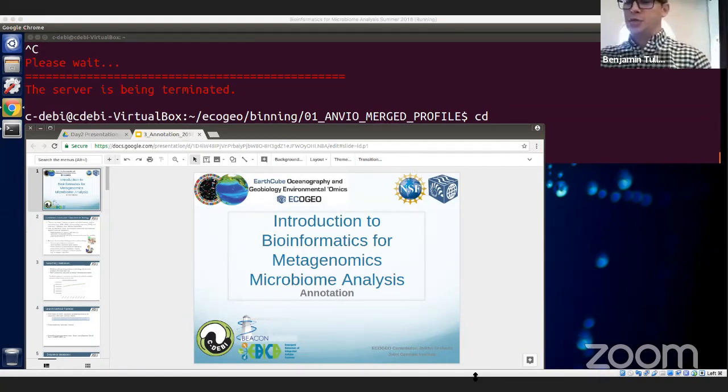Welcome back to day 2, part 3, where we're going to talk about annotation. And so we're just going to dive right into this. I have a little bit of a spiel. Like I said earlier in one of the other sessions, there's not as much hands-on right here. We're going to do a couple things with a local BLAST search and a local HMM search to get a feel for what that is.